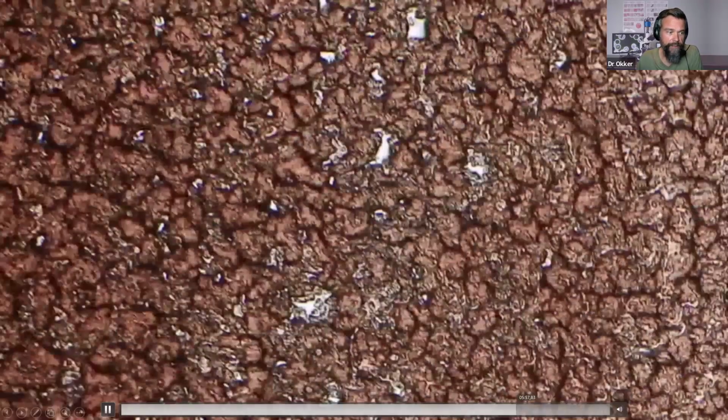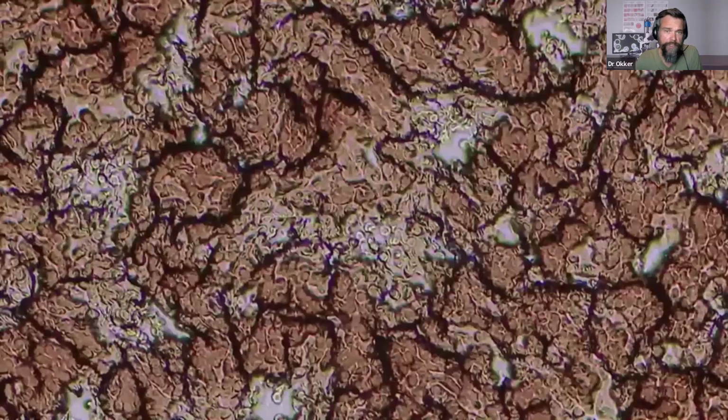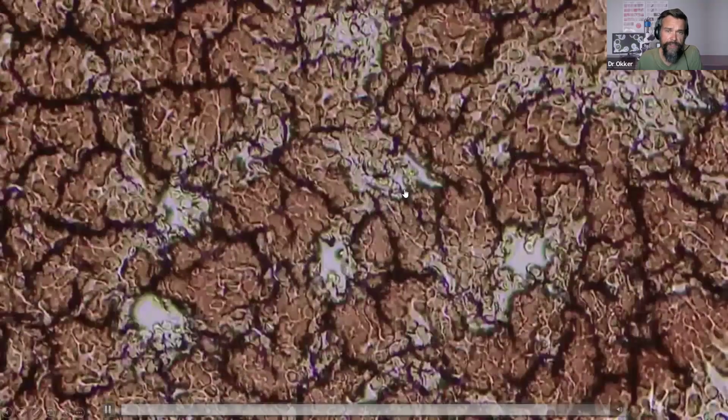Right, let's skip ahead a little bit here just so we can see these larger patterns. So in this view, we've increased the magnification. We'll see us going to a higher setting here, and we just zoomed into a particular portion of the dry blood sample, and we're seeing these areas of broken fibrin. These also indicate challenges with the blood sugar level. So, when there's an issue with candida, often we find that blood sugar also tends to become problematic in these cases. Again, a very sensitive indicator.